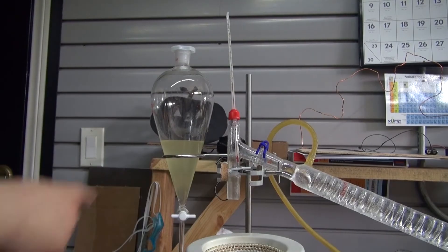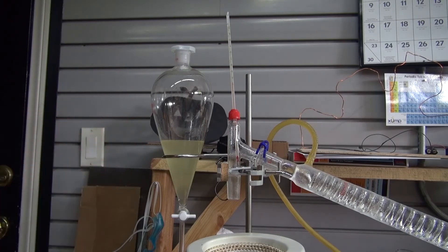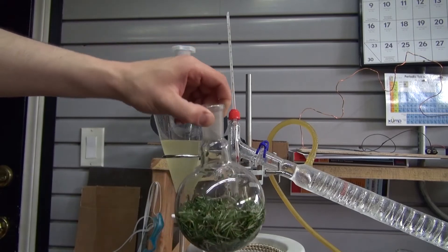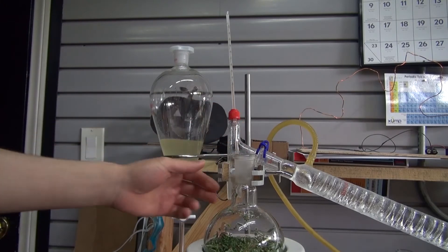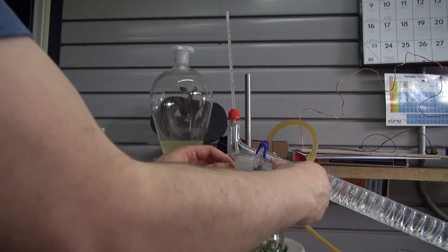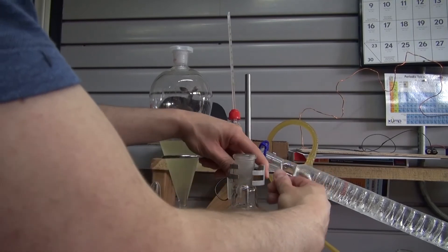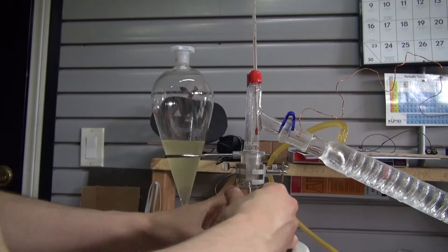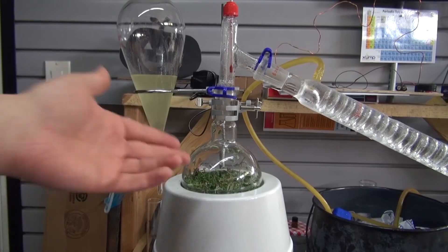Basically what I've done is I took my first batch and put it to the side just so I can compare my second batch to the first one. I have my second batch ready to go. Place it into my heating mantle, clamp it into place, reattach the joints, and turn on the heating mantle.